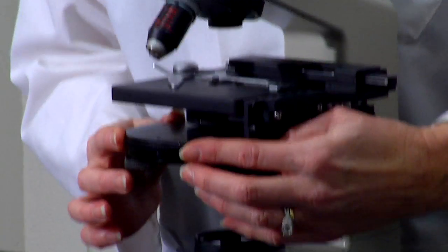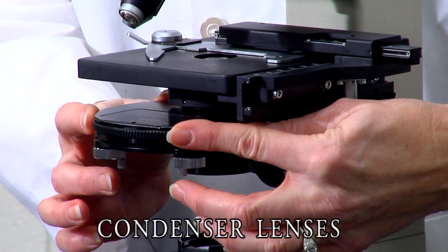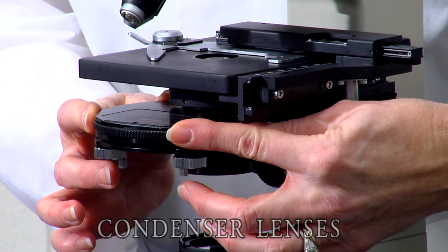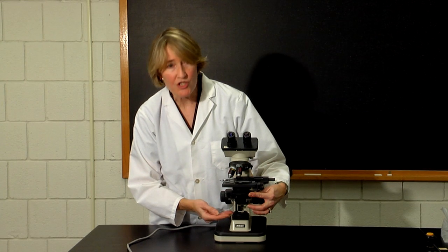Below the stage is a rotating disc which contains the condenser lens systems. This is the third set of lenses. These don't magnify the object, but rather concentrate light from the illumination source below, so that it shines onto the object in a way that enhances the illumination of the specimen.